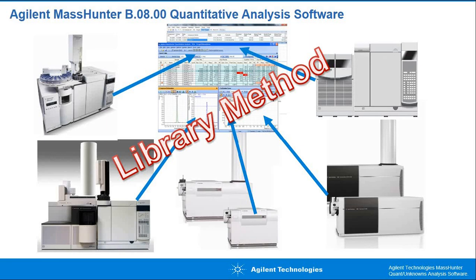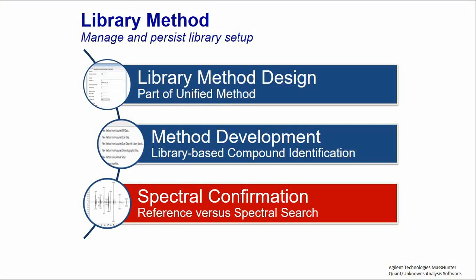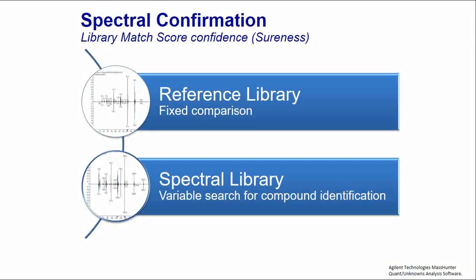Welcome to a discussion of the library method and its participation in spectral confirmation. This discussion will clarify the difference between a reference library and a spectral search library. So, the distinction. The purpose is different.